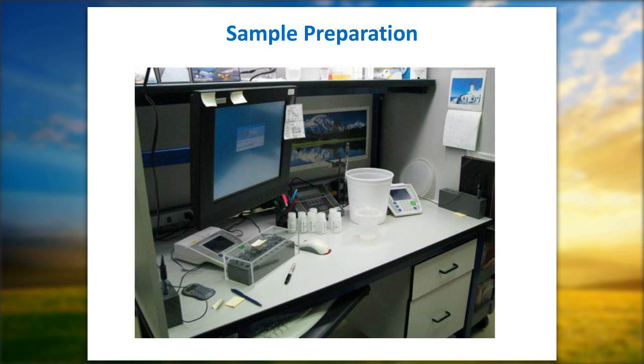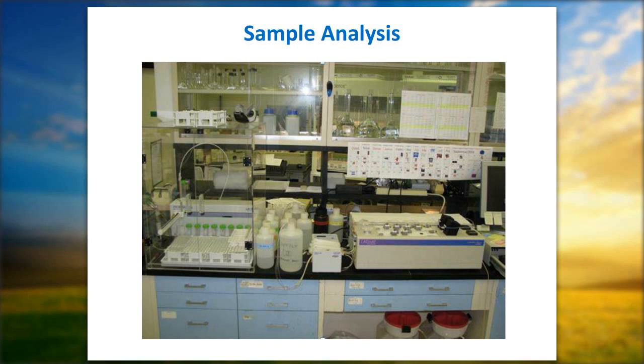And yes, I realize this presentation is about sample validity. Why are we in the lab? Well, it's really the chemistry that we look at for screening when we have contamination in the samples. Just because you observe insects or leaves or plant matter or even bird droppings in the sample, it doesn't guarantee or indicate that the sample will be invalid. It's only when we look at the chemistry and the history of the chemistry at the site that we decide whether a sample is abnormally contaminated.